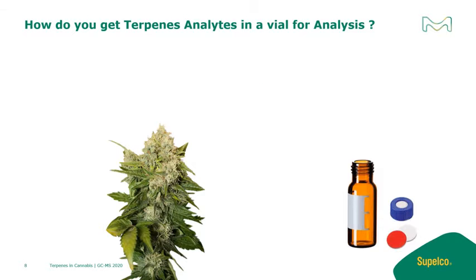Let's take a look at the sample preparation steps. How do you get terpenes analytes in a vial for analysis? There are many different possible ways to get analytes extracted prior to analysis in terms of sample preparation techniques available to us analytical chemists.